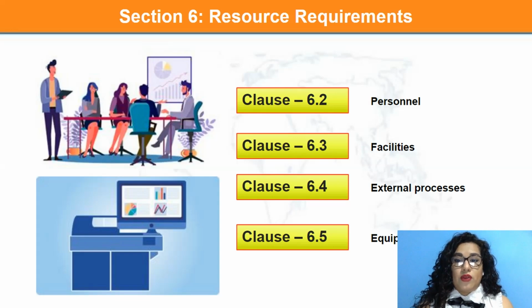And the equipment requirements. A biobank shall be furnished with or have controlled access to all equipment required for biobanking. This clause is all about the traceability of your equipment. When was it calibrated? When was it last maintained? Which SOP was used? Well, how can a LIMS help to answer all these questions?